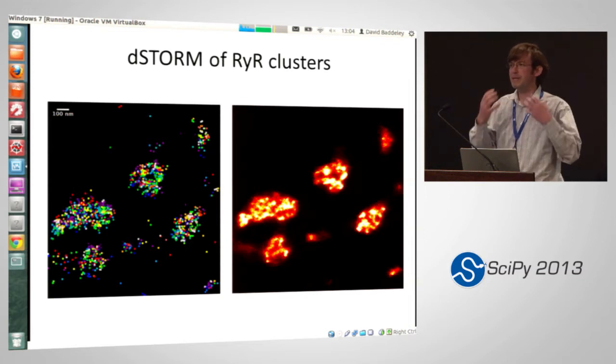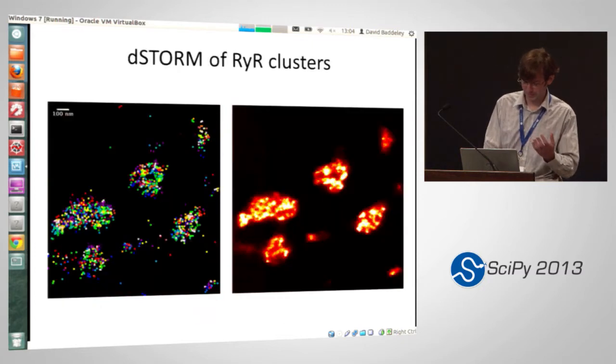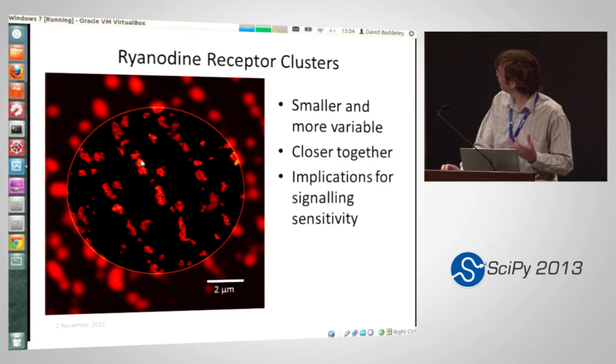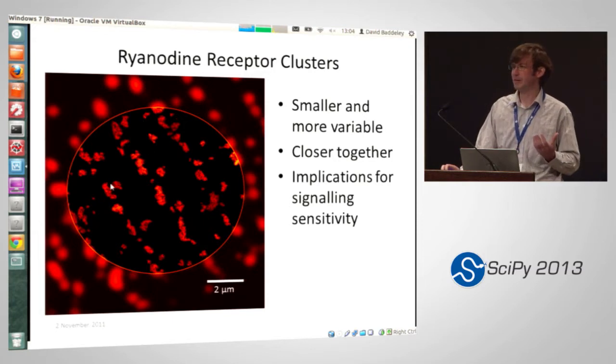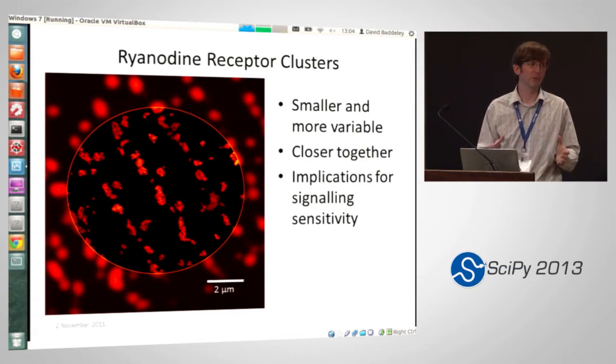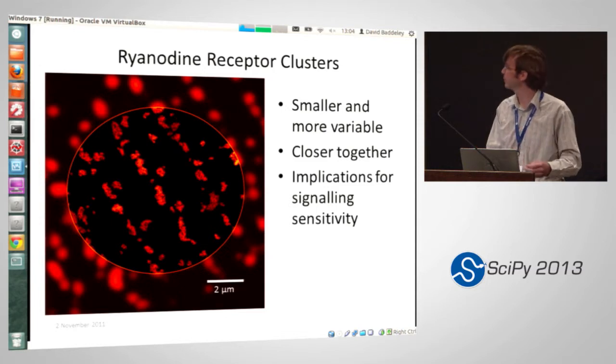And what's made this possible, and what a lot of the challenges are in doing this, I missed out a slide here, and by doing this we can get new biological insight. And so this is an example of one protein cluster that we've looked at, and we found a number of things that hadn't been previously observed. And there's a lot of people doing this now, and it's one of the big new fields that's taking off in biology, this super resolution light microscopy.